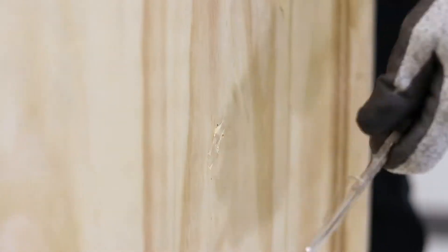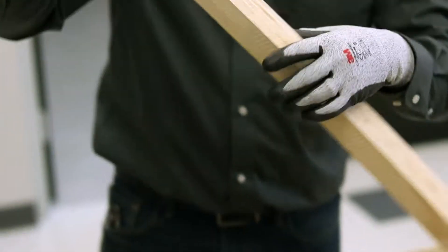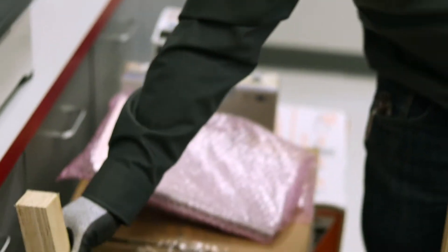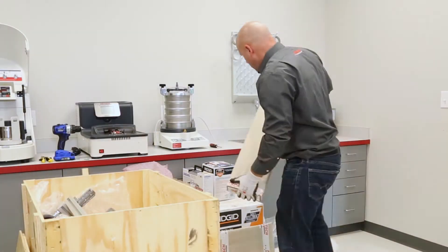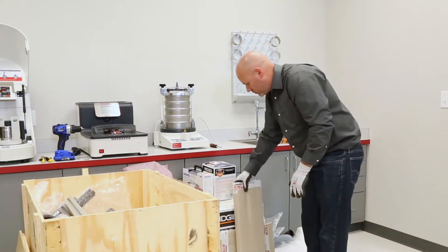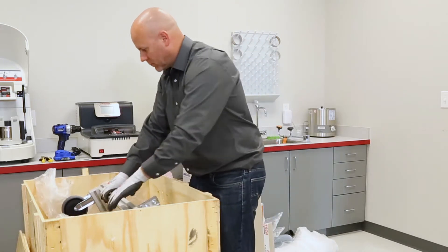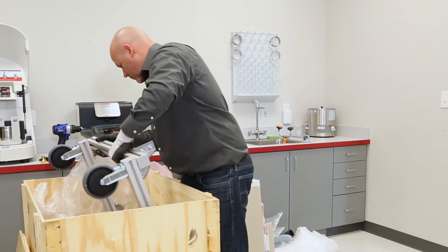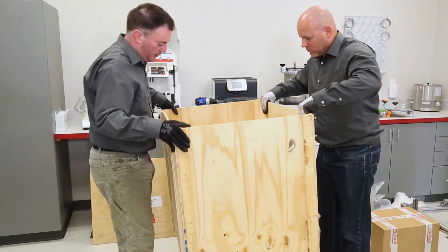Using a screwdriver or pliers, remove all staples. Remove all remaining screws around the bottom of the wood crate and lift off the side walls.